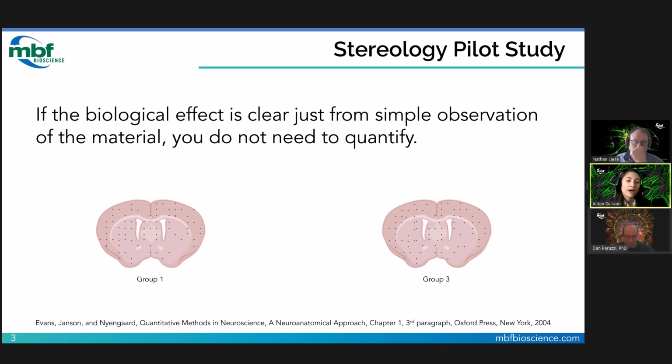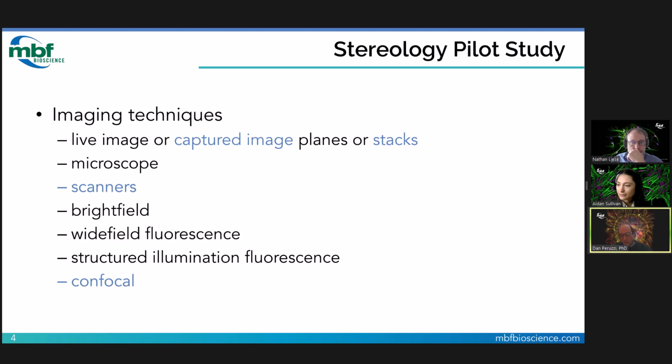Okay. Well, I expect my treatment will reduce the cell populations in the right dorsal portion of the anterior cingulate area, but when I look at my sections, I don't visually see a difference in my populations. So I'm looking to use stereology to verify if there really is no difference or tease out a statistically significant difference if one does exist. Okay, sounds like we do want to use unbiased stereology. So my next question is, how are we visualizing your data?